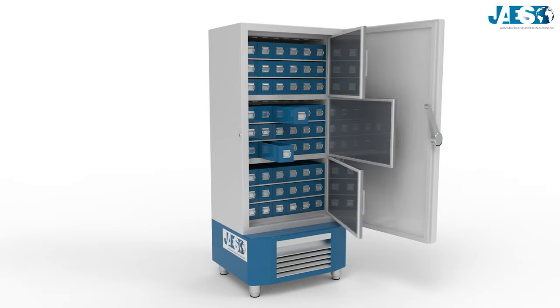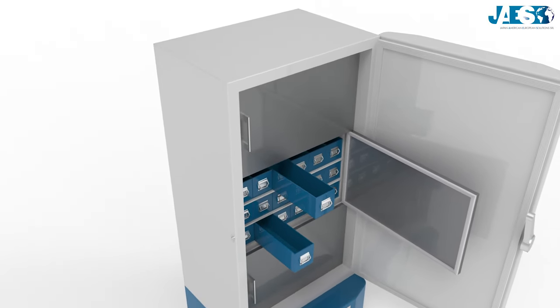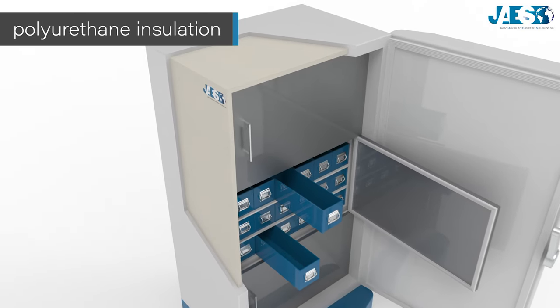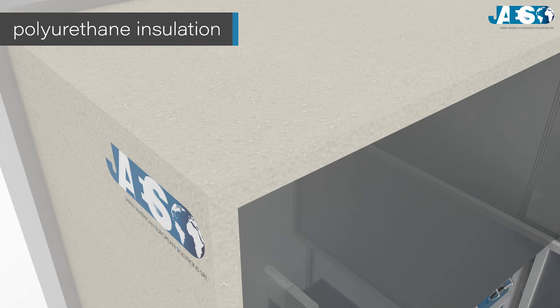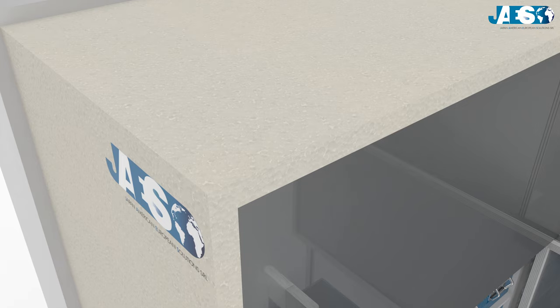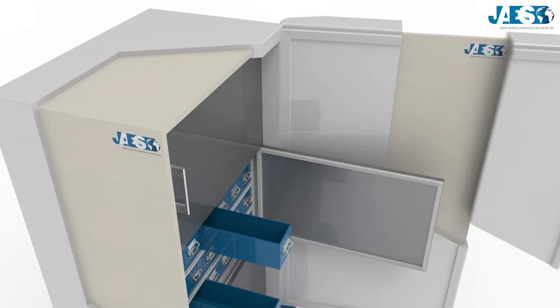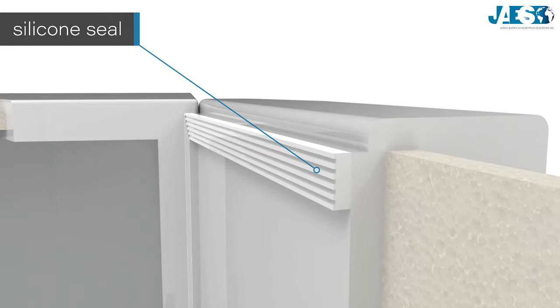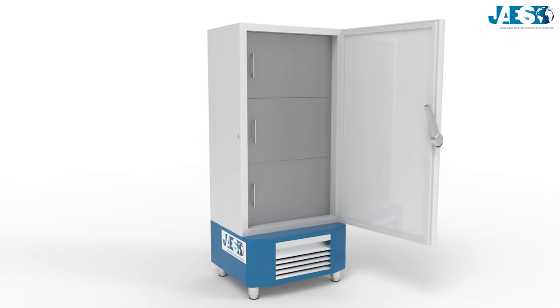In this way, when a sample is taken from a drawer, the other drawers can maintain their temperature. Between the inner and outer wall is a polyurethane insulation, which is essential for the ULT freezer in order to maintain the low temperature. The door has the same polyurethane insulation as well.